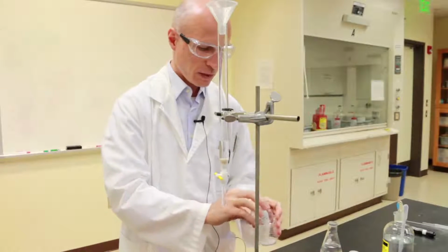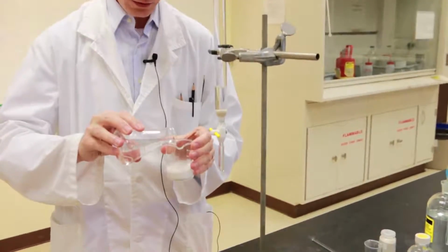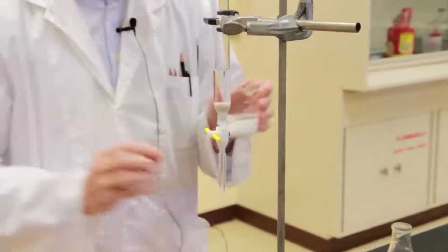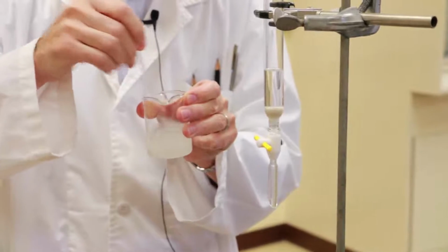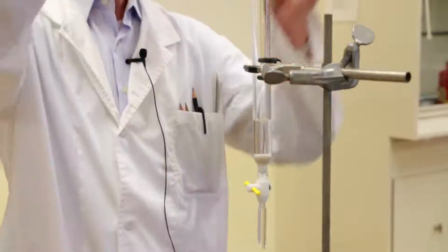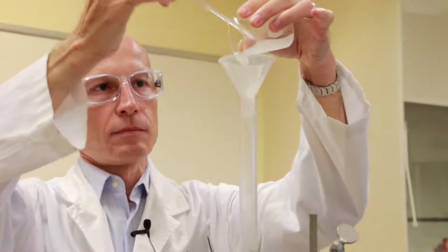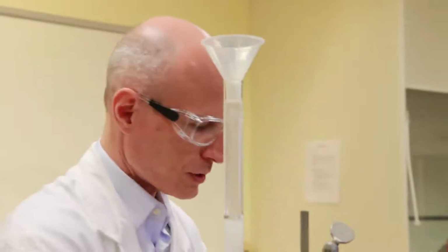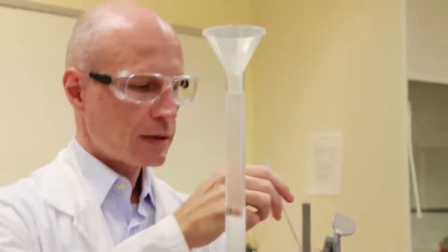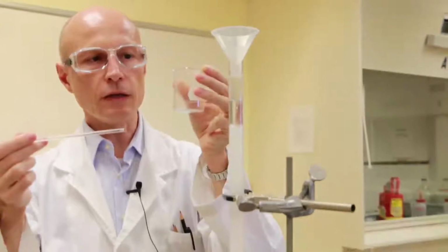You transfer it into a bigger beaker and you want to make a slurry with your solvent. So you add enough solvent, oops, sorry, that's not a big deal. Then you add enough solvent to make a very runny slurry, fairly liquid, and you want to stir it very well. And then you need to pour it into the column while you are stirring to keep the gel in suspension. So you do this. And then you can add some more solvent to rinse the beaker. And it's not important that not all the silica gel is going into the column. This is totally inconsequential.